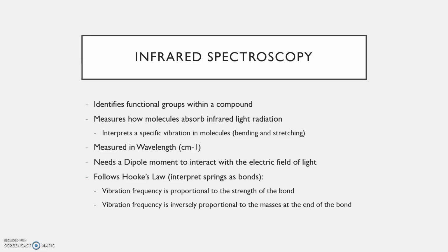Another law to keep in mind is Hooke's law. Hooke uses springs and balls, but we're using bonds and atoms. This is saying that the vibration frequency is proportional to the strength of the bond. Stronger bonds will absorb at a higher frequency, while weaker bonds will absorb at a lower frequency. We also see an inverse proportion relationship from the vibrational frequency to the mass at the end of the bond. So bonds with lighter atoms absorb at a higher frequency, while bonds with heavier atoms will absorb light at a lower frequency.